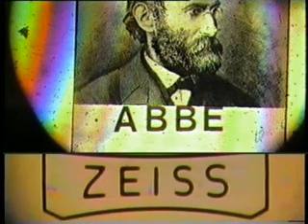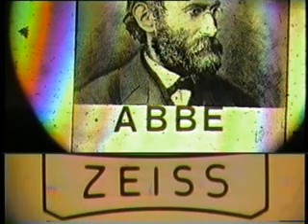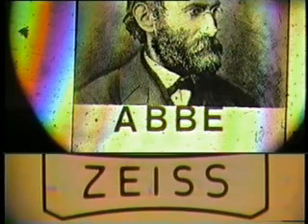What you see here is an introduction to the experiments that I'm going to show you. It partly serves as a reminder of conjugate planes, and partly it's just a little bit of fun, and it gets you familiar with what the two halves of the screen are showing you.